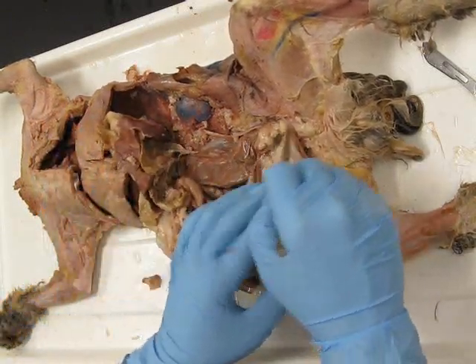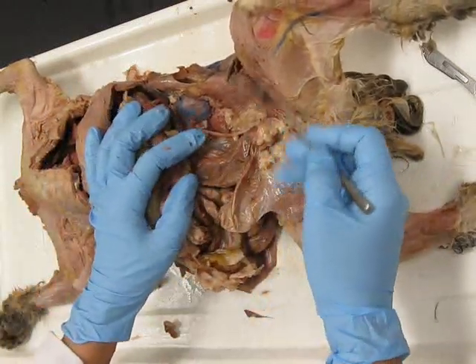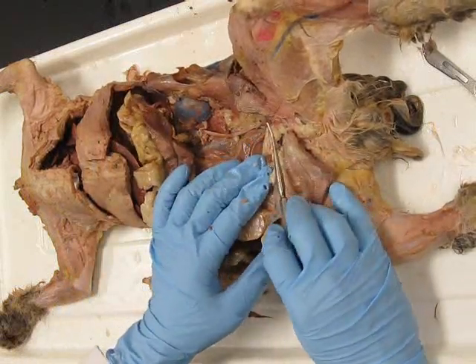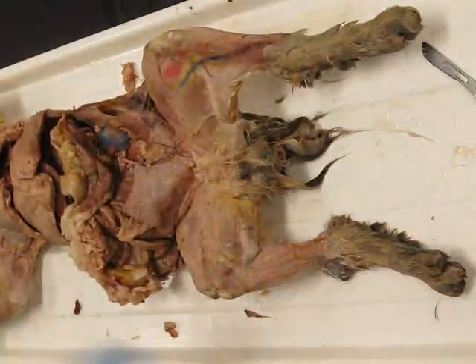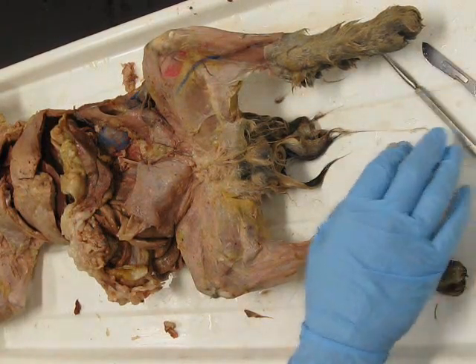Alright, now for females, they'll come around again to everybody's table that has females and show them the structures, and then you can show your lab partners. For males, you're going to actually do a dissection of the scrotum and find the testis. And you're going to do that for both scrotal compartments, or both testis.